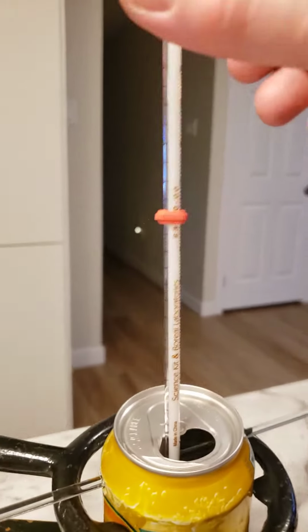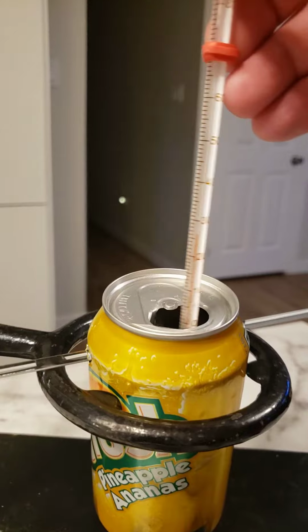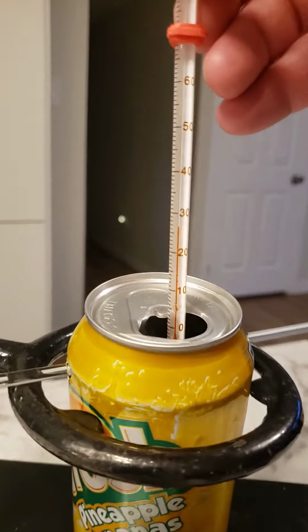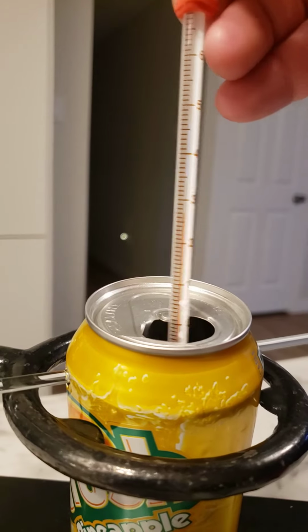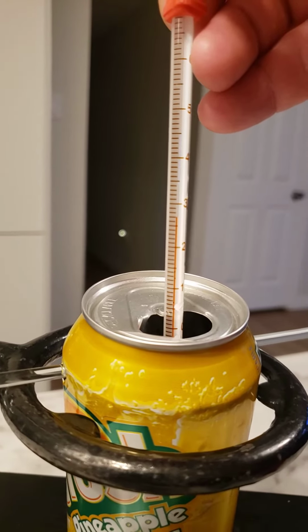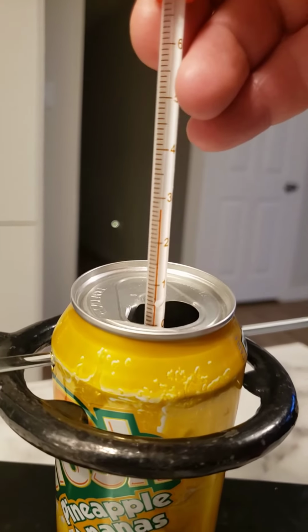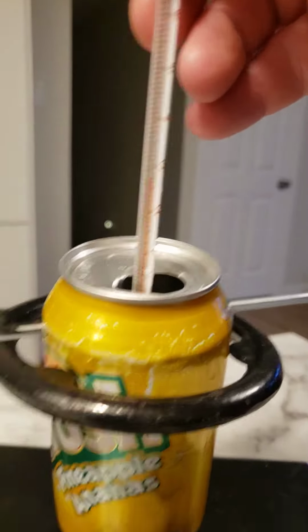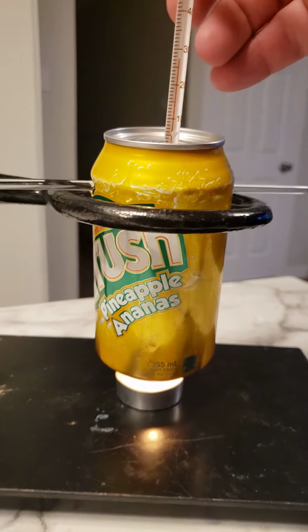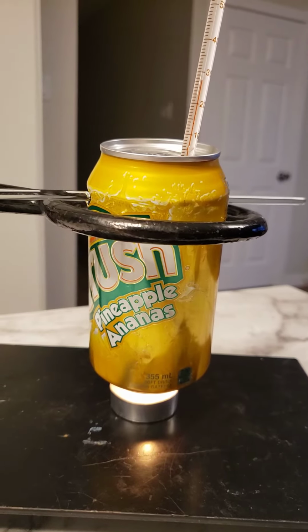If I go to the thermometer now, I'm using the thermometer as a stirrer. And as you can see from the picture in the initial temperature, which was certainly not up to 27 degrees Celsius, as the water is going now, the water is increasing, go figure, in temperature, given the fact that we've had a tea light candle lit under this can with the water in it for a couple of minutes.